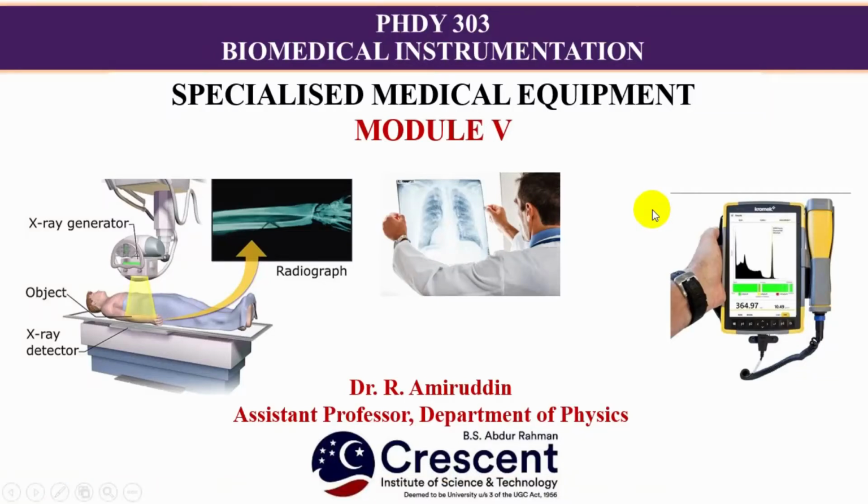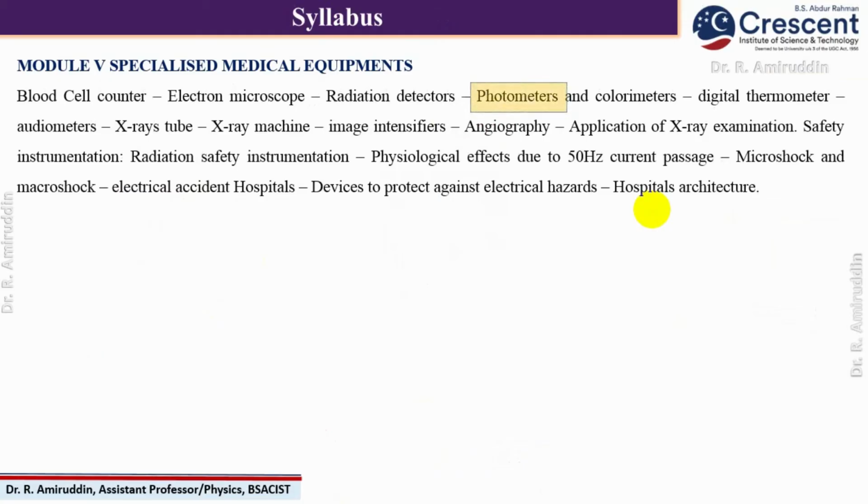Dear all, welcome. The topic which we are going to discuss is specialized medical equipment, and as part of the course, let us start with photometers, and understand how this photometer instrument is used in biomedical instrumentation.